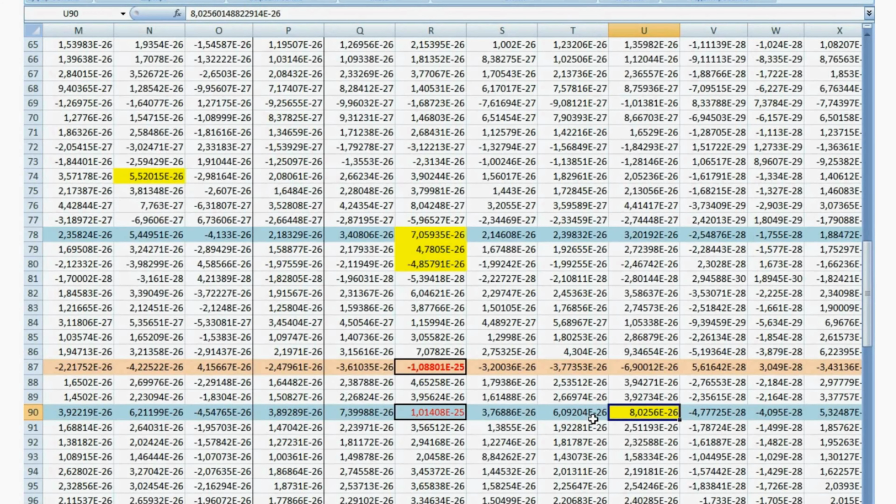The table shows the values in the area of maximum values: alanine 142 from the whole protein and isoleucine 81 from the back peptide, alanine 142 and leucine 80, and the maximum value in the positive area of potential energy of electrostatic interaction of alanine 142 and alanine 79. Above is the maximum value in the negative range.